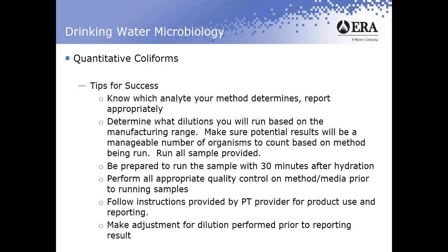So some tips to succeed. Again, know which analytes your method determines and report appropriately. These different methods will produce different standard deviations, and because we're grouping the data and evaluating based on those standard deviations, you need to be really sure that you're reporting it within the right data set.